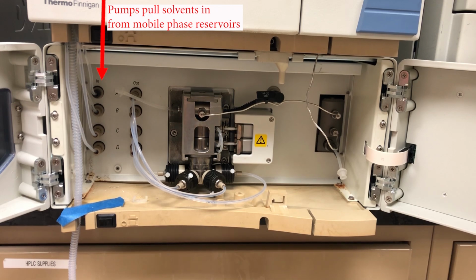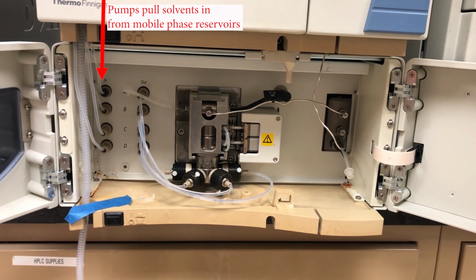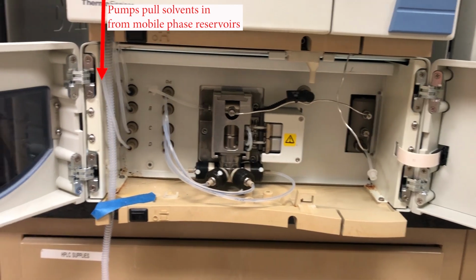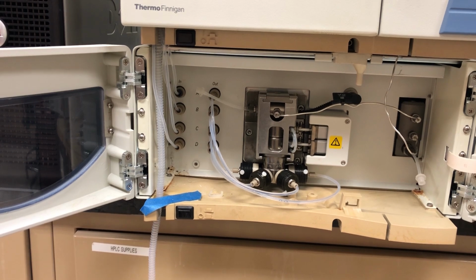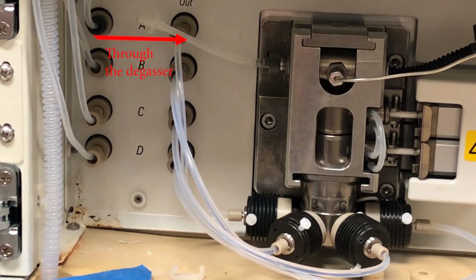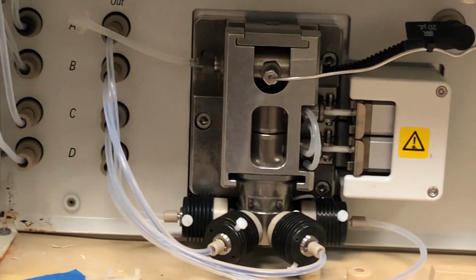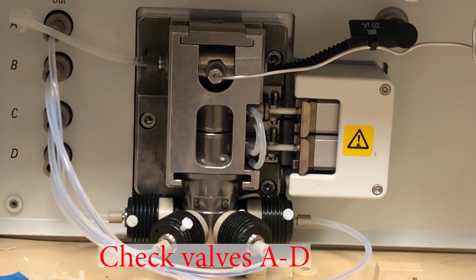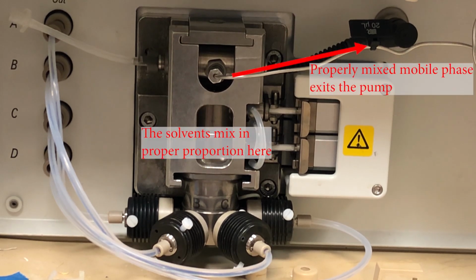Okay, so if we close that valve, so now the syringe is pushing out, let's trace the flow of liquid a little bit. The pumps pull the solvents from the mobile phase into that ABCD. We're usually just going to use solvent A and B, almost always just going to use solvent A and B. Now between that A in and A out and B in and B out is the degasser that gets rid of the bubbles. And then those 4 little plastic things are actually check valves. They get pulled into a mixing chamber so we can change the proportions of the solvent.